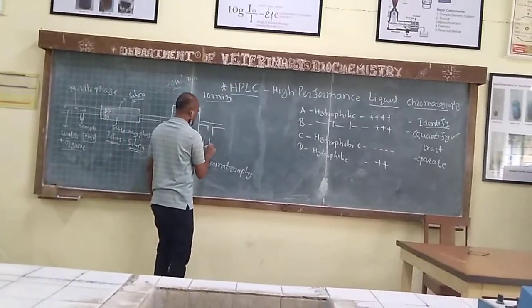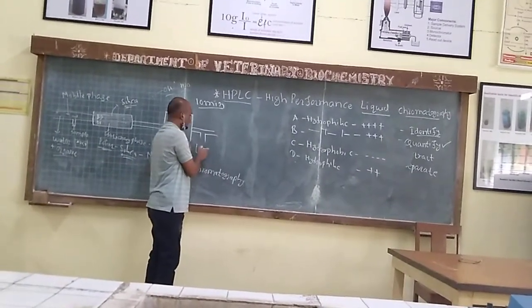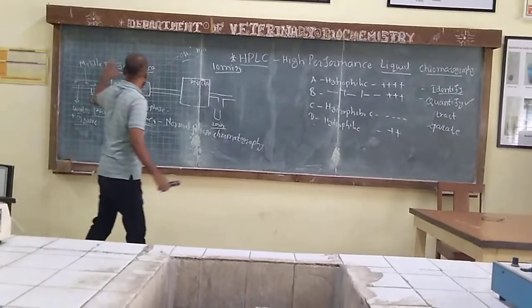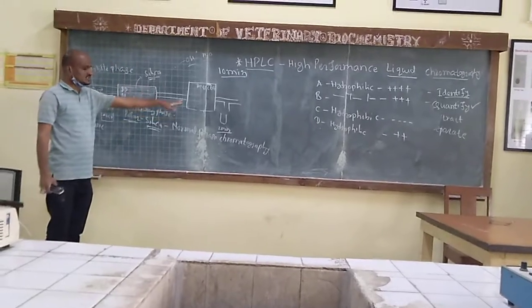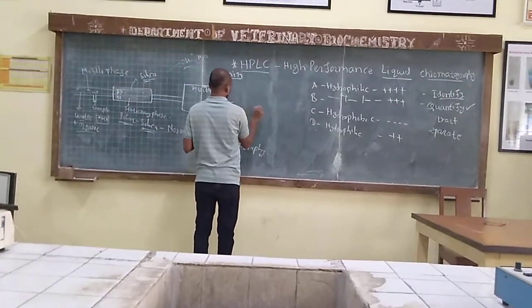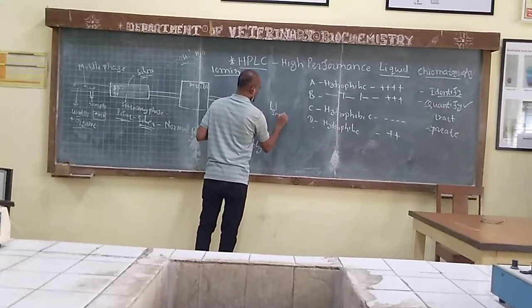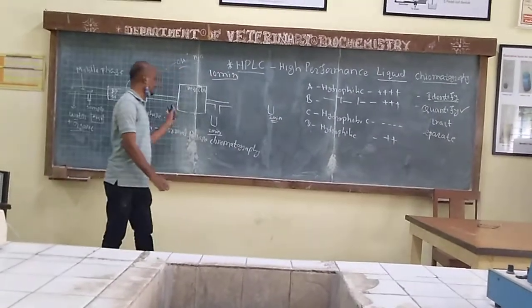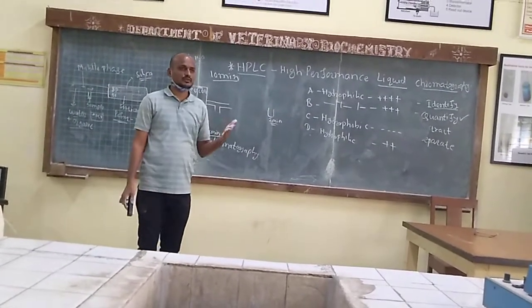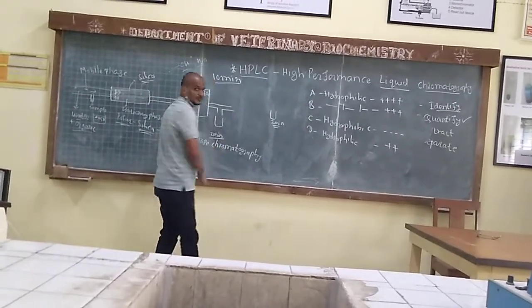So one tube we are taking. We are collecting it here after 2 minutes. Once you start this HPLC system, after 2 minutes, we are collecting the first fraction collection. Okay, so you are passing it through this one, and now we have collected one tube. 2 minutes. This tube we have collected, we have kept it at the other position. 2 minutes. What you will do? You will wait for 2 minutes again. You will again put another tube here.